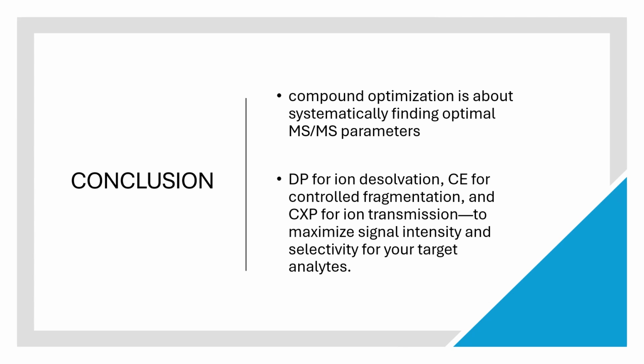While this adds an extra step to method development, your detection limits will suffer without it. This optimization creates the foundation for successful chromatography and source optimization that follow.